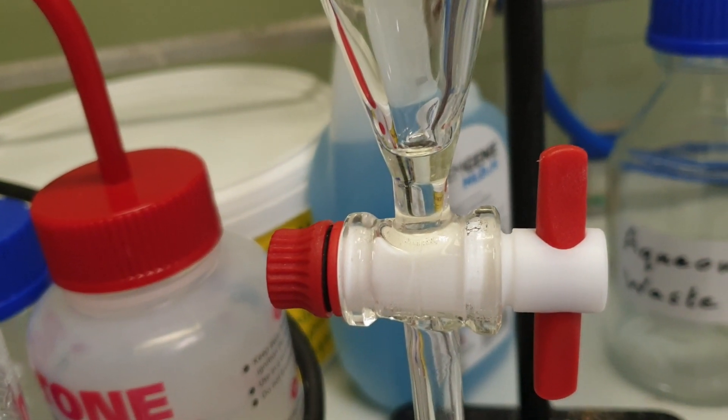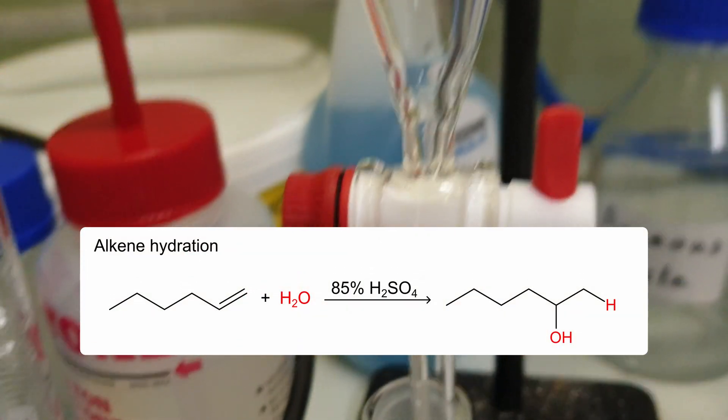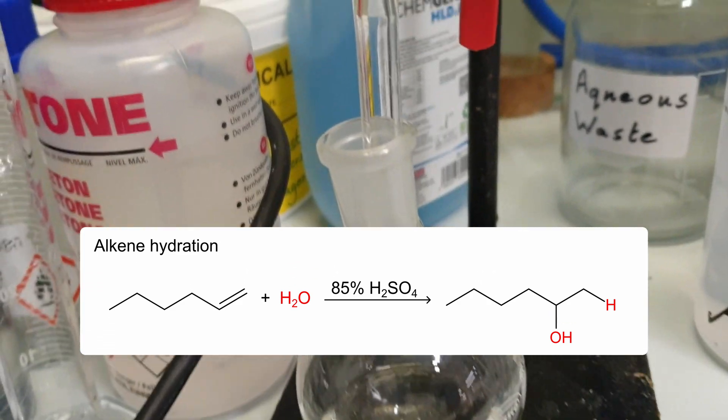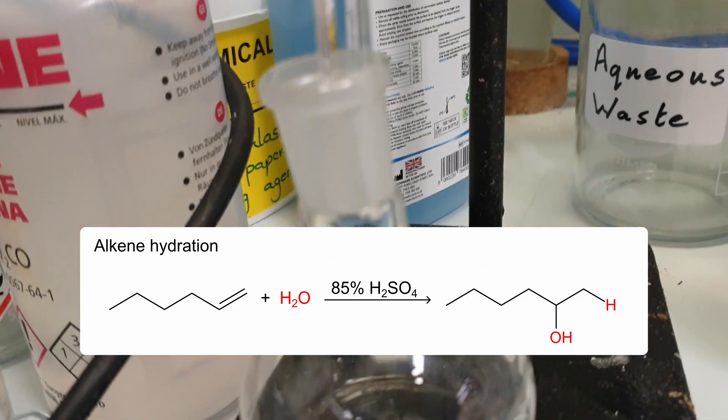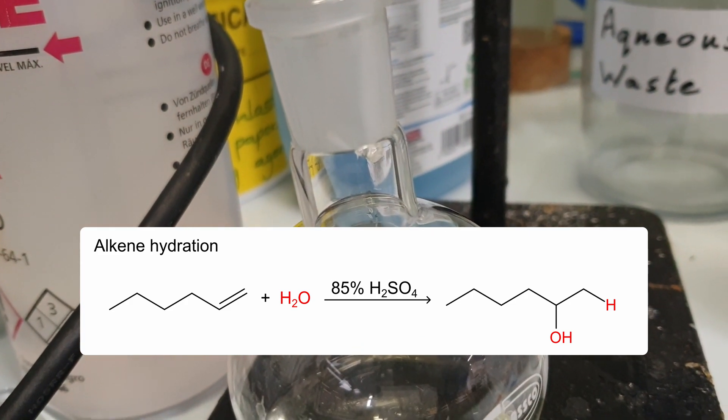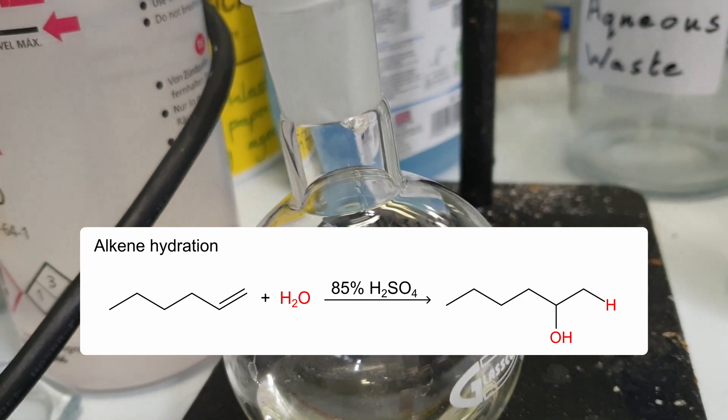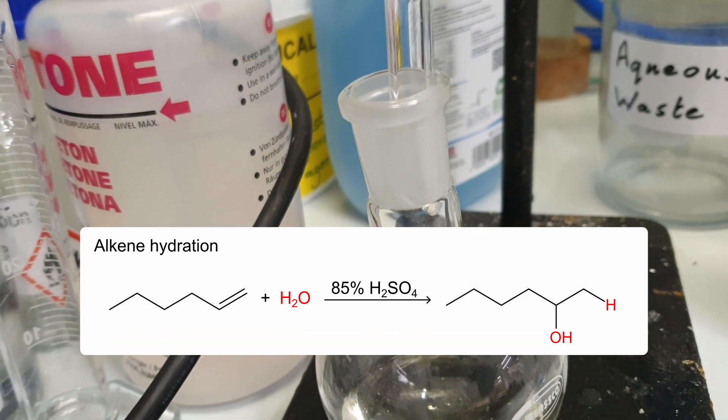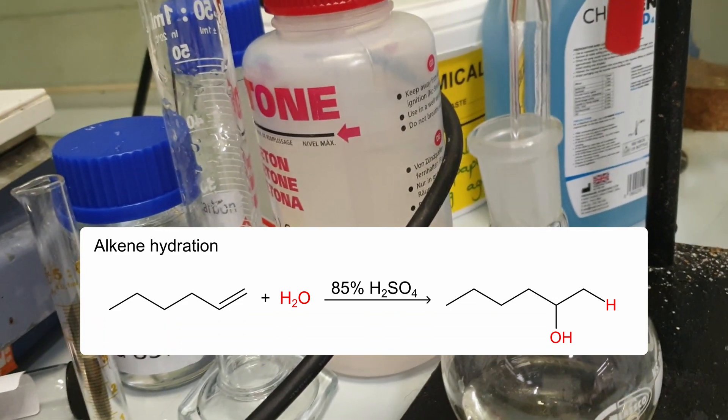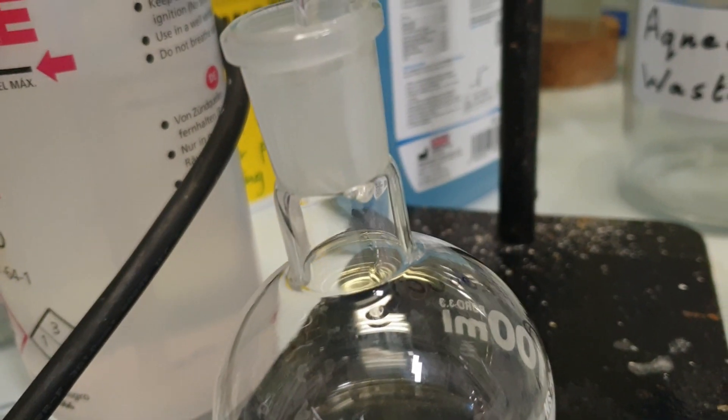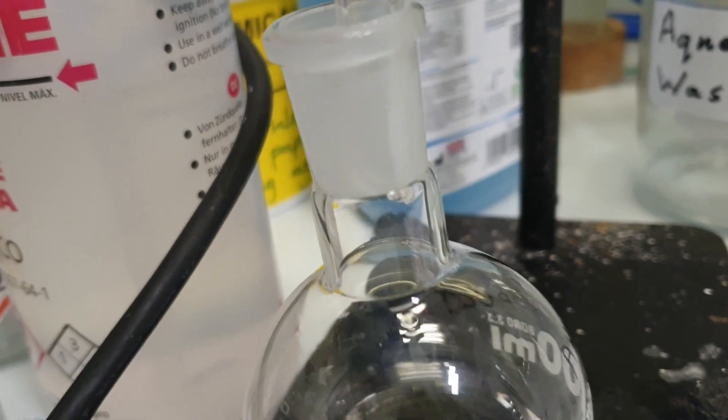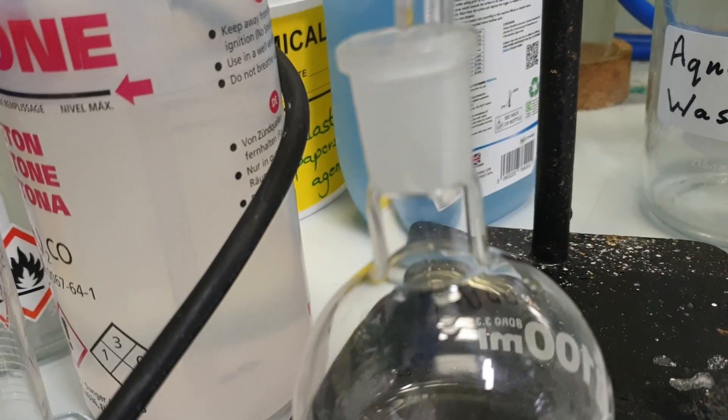You might be wondering what reaction am I carrying out? Well it's in the title of the video. It's alkene hydration, adding water to an alkene functional group or a double bond. Two hydrogens and one oxygen literally adds on to where the alkene functional group was. This reaction mixture contains concentrated sulfuric acid and hexene.